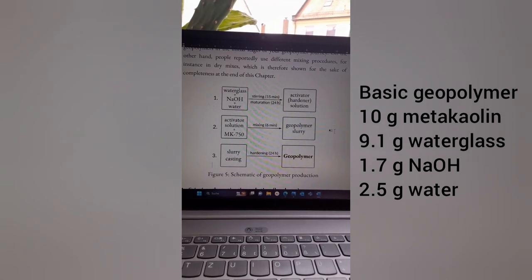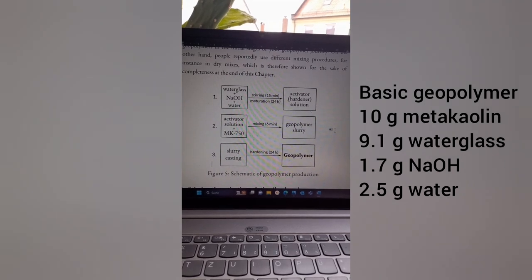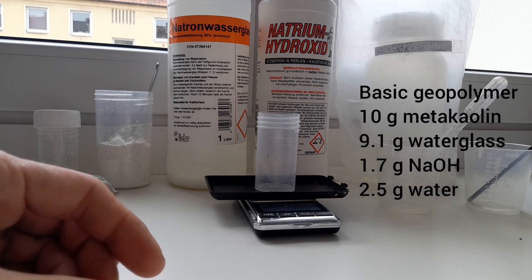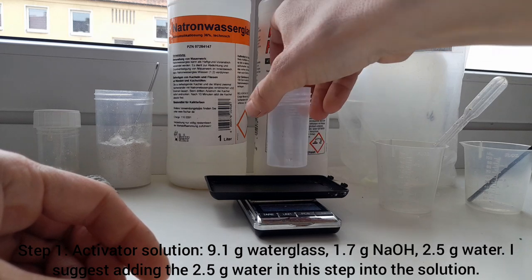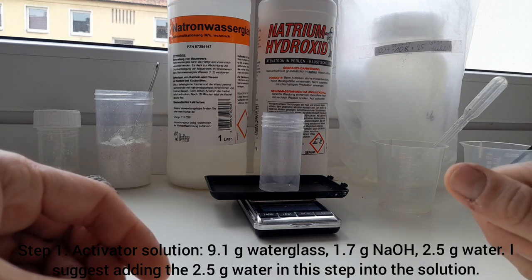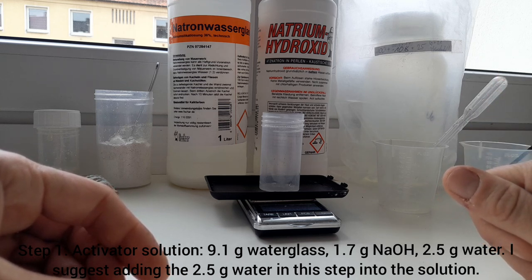We are in the laboratory and we want to mix a geopolymer based on 10 grams of metakaolin. I like to do this in a small container, which gives me a good first impression about the geopolymer raw material and what I can expect if I scale it up.